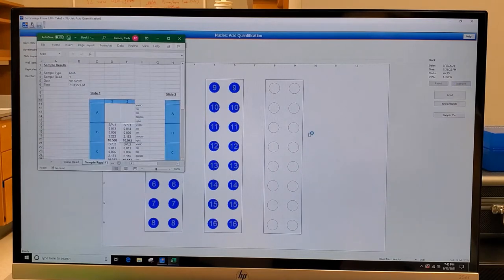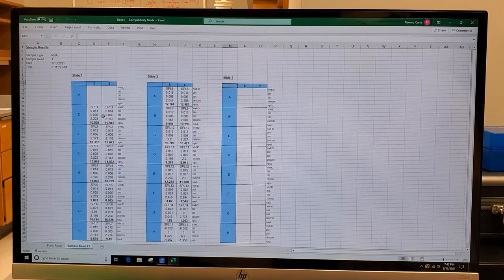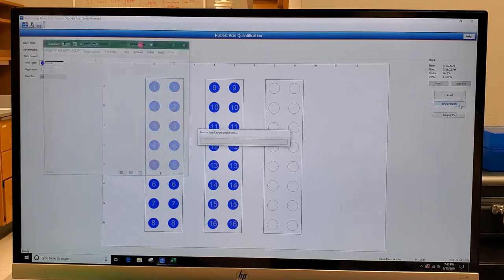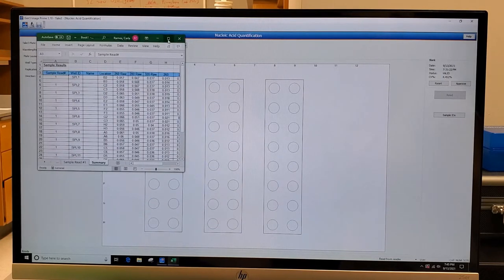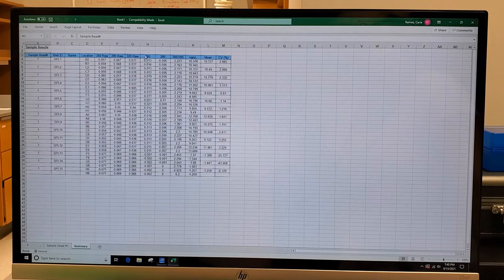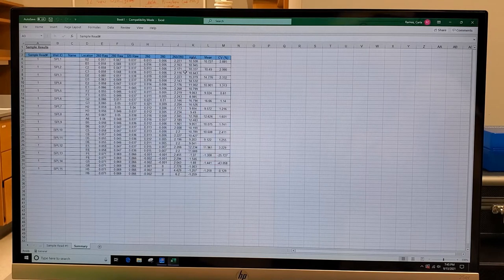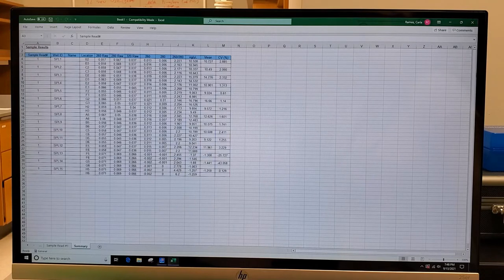Once your run is done, click 'Approve.' The results export nicely to Excel showing blank values and sample values. Click 'End of Batch' and you have all your raw data. The output gives you concentration in nanograms per microliter, the mean of your two replicates, and then you multiply by your dilution factor — in my case a factor of 10.